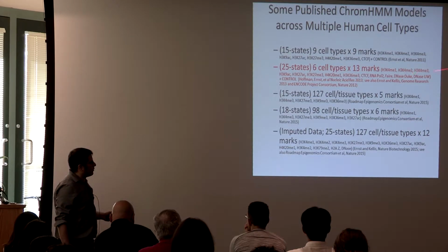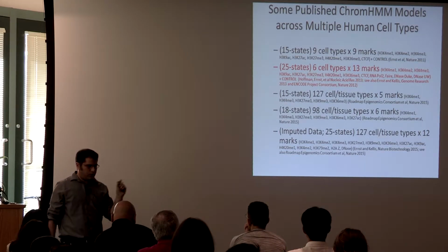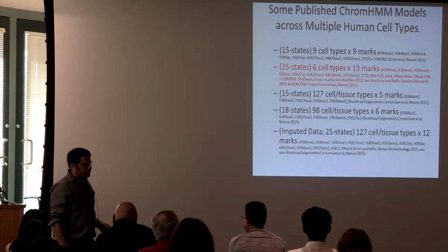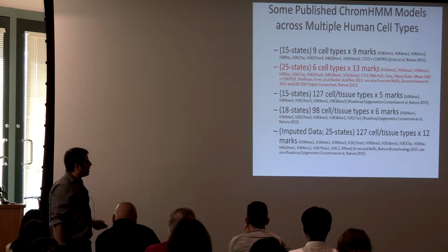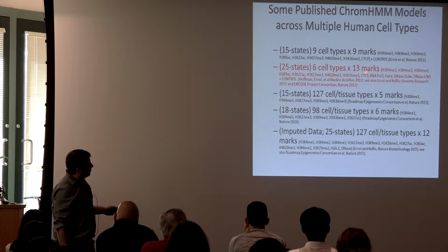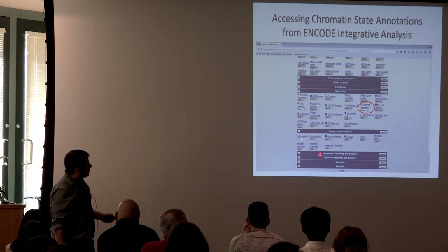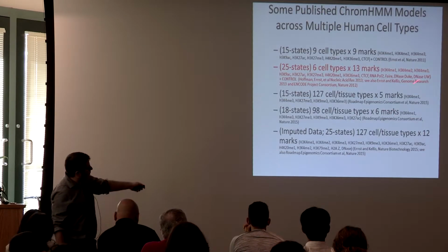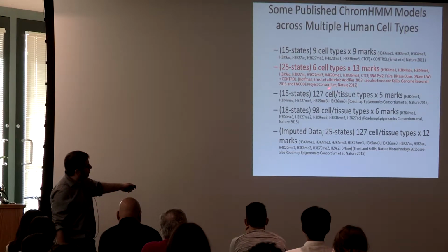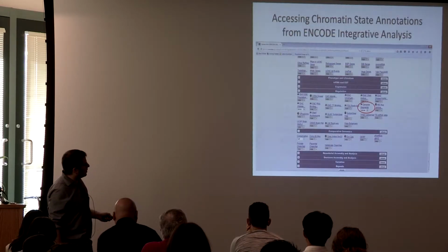And there are two different protocols for measuring the open chromatin, one by a group at the University of Washington and one by a group at Duke. They have overlapping, but in some cases different properties. And then FAIRE, which is another protocol for measuring open chromatin. So it's a little deeper in terms of the mark coverage, but it was on 6 of the 9 cell types. This was the main publication, and it was also described or mentioned in the main ENCODE consortium publication and some additional analysis in this 2013 paper.